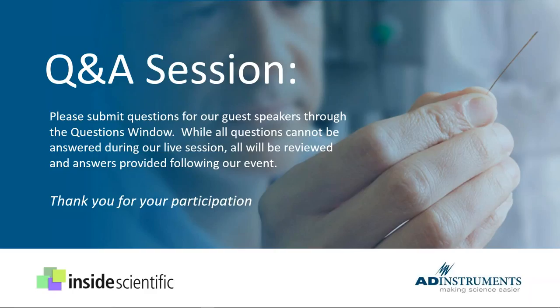John Kingma has asked, do pressure volume loop results differ when the approach changes? The two most common approaches, and we'll just use the mouse in this situation, are an open chest approach, apical stab, or going retrograde through the aortic valve. So in your experience, Jim, does the approach change the way you look at doing analysis, and do you see any common differences between the way that the data is recorded?